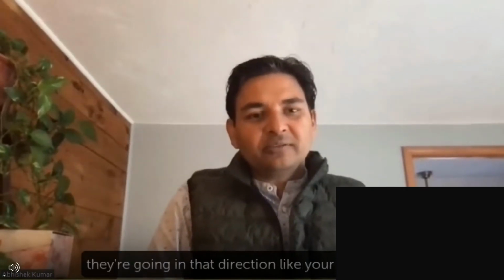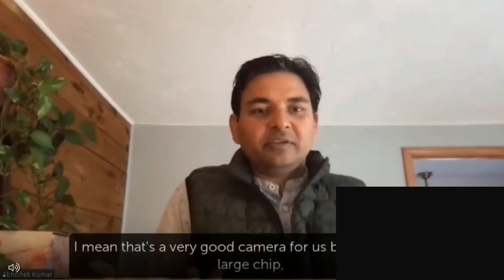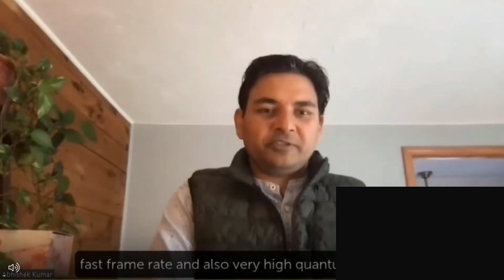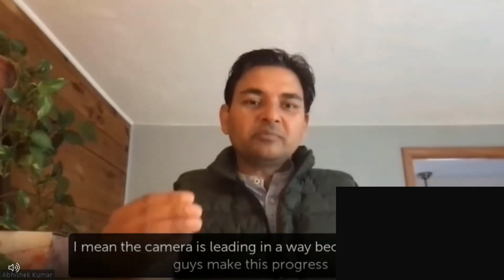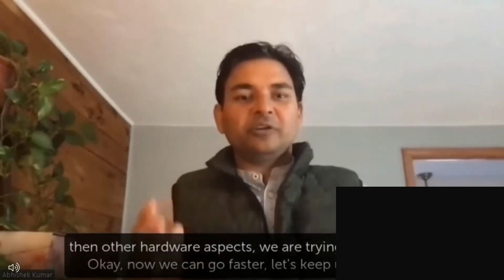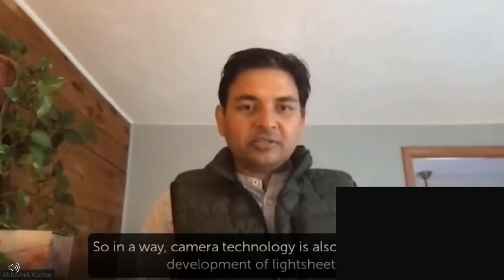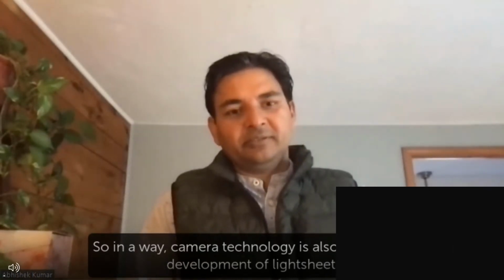That's what camera companies are going towards, like your 95B. That's a very good camera for us because it has a large chip, fast frame rate, and also very high quantum efficiency. Camera is leading in a way, because once you make this progress and say, okay, now we can go faster, then the other hardware aspects, we try to follow that and keep up. So in a way, camera technology is also leading the development of light sheet.